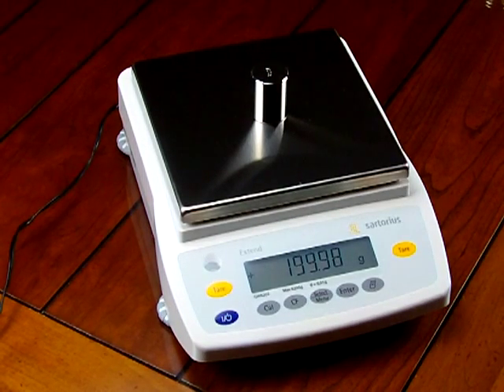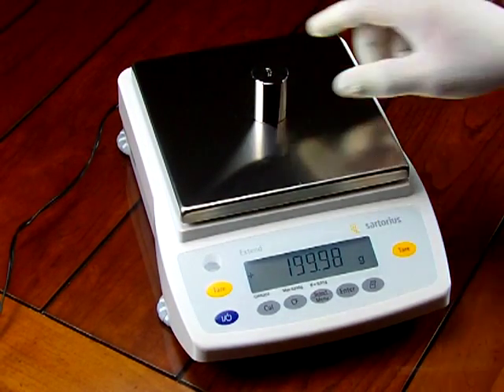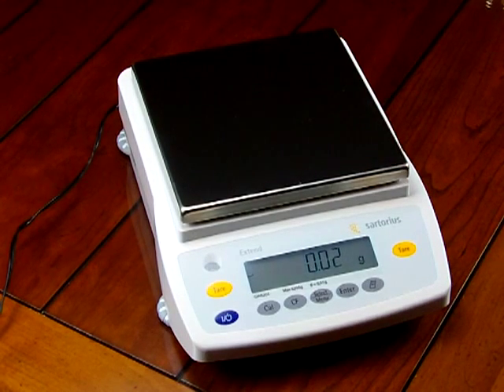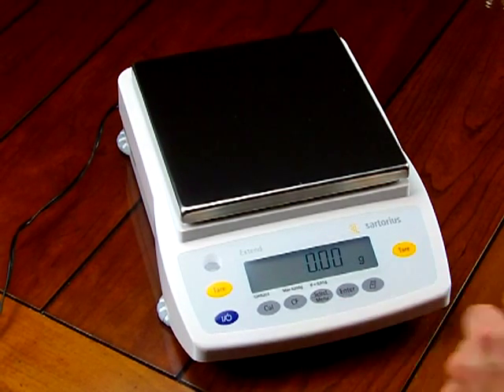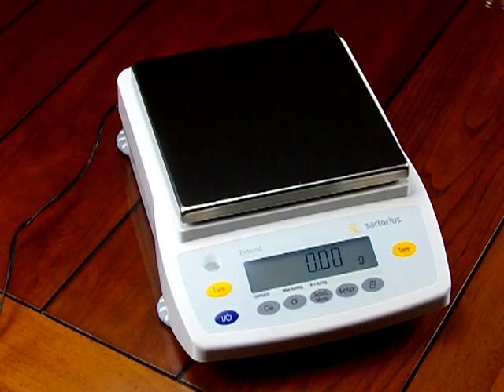We've already covered the 3-year limited manufacturer warranty and calibration. Calibration is simple — just press the button for motorized internal calibration. Our best recommendation for a 0.1 gram balance is right here: the Sartorius GW6202.